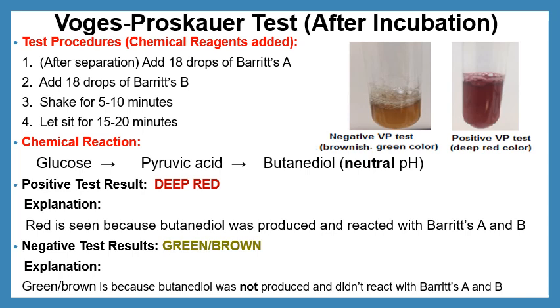The most important part of this test is to let it sit for 15 to 20 minutes. The longer it sits, the more it will react. If you do not wait, you will see a false negative result.